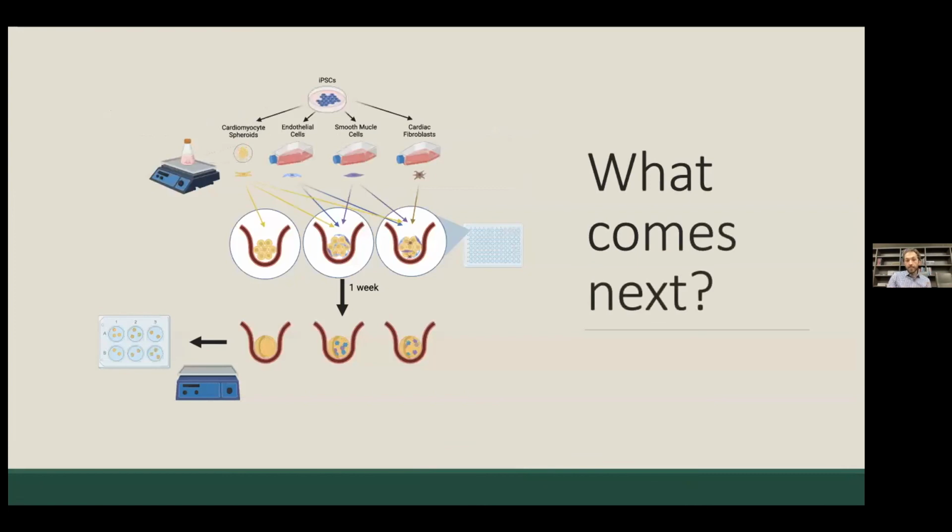So what comes next? In our work, we're continuing to do more quantitative examination of these organoids and doing this in a more standardized way. As I said, those are only with the initial group of cells, but we're continuing to repeat these studies with these 3 different groups and looking at all of those different time points. So we're hopefully going to have a lot more data to show you in the next few months going forward with these organoids.